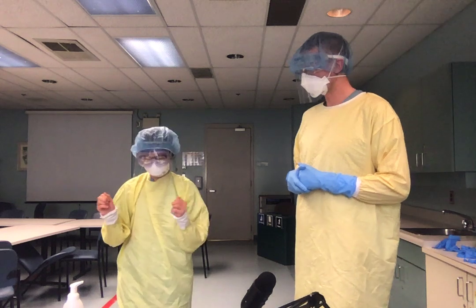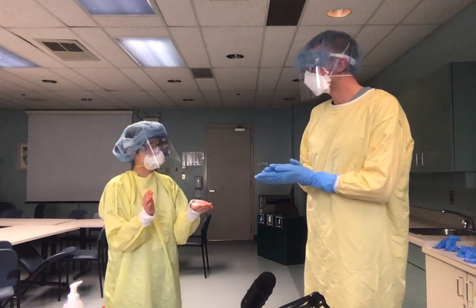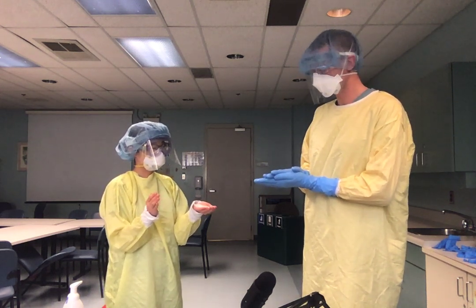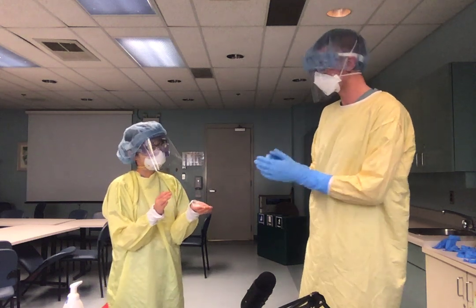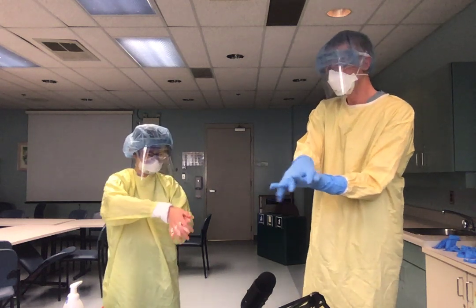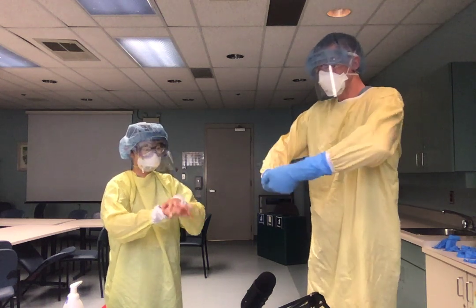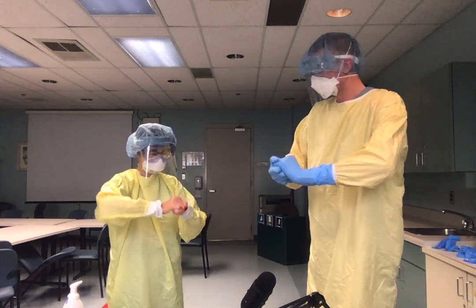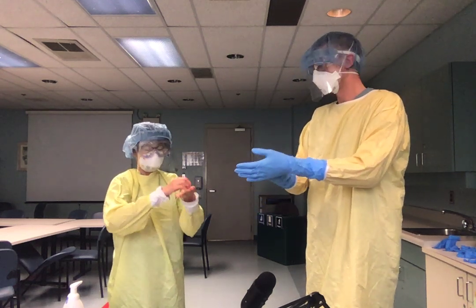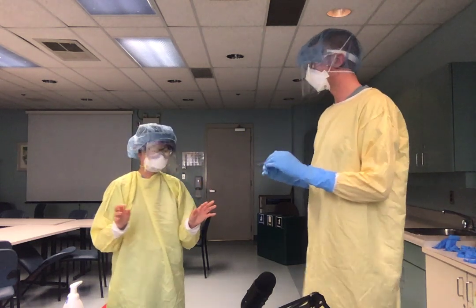We're going to do a nice hand wash here, Nancy, so give yourself a couple squirts of hand sanitizer. I'm going to walk you through every step, because you do want to do 15 seconds, but if you do 15 seconds sloppy, you're not getting all the surfaces. So Nancy, start with your palms, and then work into the webs. We're going to do the back webs on both hands now. Okay, we're going to do our knuckles. We're going to get our thumbs. Okay, we're going to do our tips. Perfect. And we're going to leave the wrists out right now because we've obviously got that gown on still.